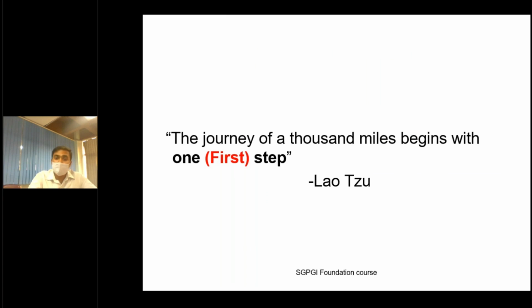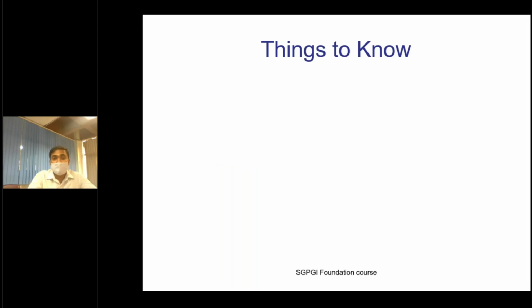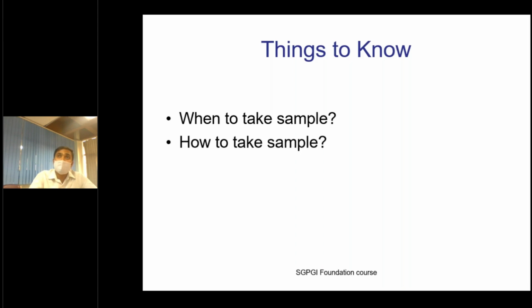As Lao Tzu says, the journey of 1,000 miles begins with the first step. So let's begin with the sample's journey. In this half an hour lecture, I'm not going to make you an expert in sample collection. However, it is a skill and an art, and it has to be learned with practice. I'm going to tell you a few pointers so that you can get the maximum out of the lab. That is, when to take the sample, how to take the sample, how to send the sample with respect to different investigations.